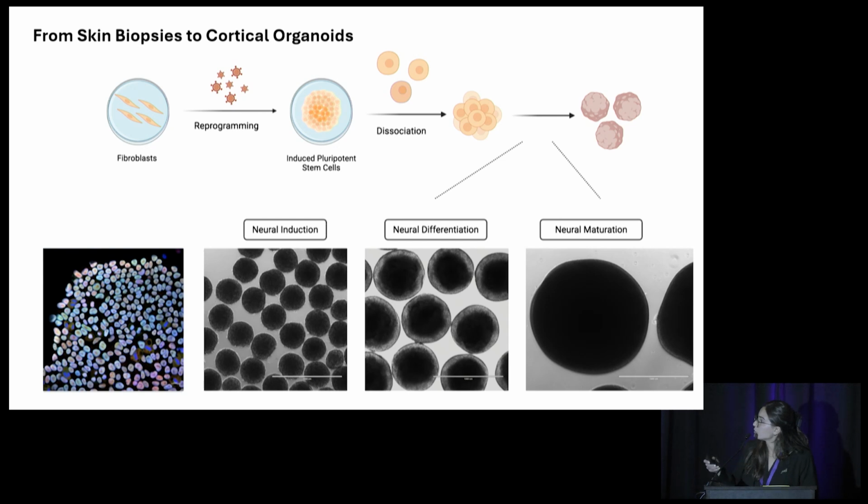So what we do, in non-technical terms, we dissociate these colonies. We turn them into single cells, and once they're single cells, we put them on this rotational shaker, make them shake, and they will by themselves aggregate in a 3D structure and form brain organoids. Now, this is a 1-month-long process. From stem cells to brain organoids. It's a 1-month process, and before it was even longer. So you guys can imagine how long it's been taking us to do all of this with all of the mutations that we received.